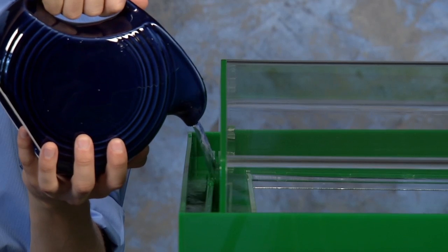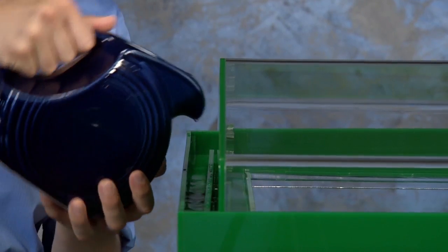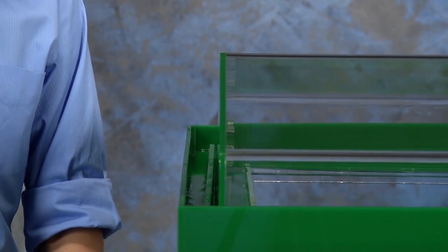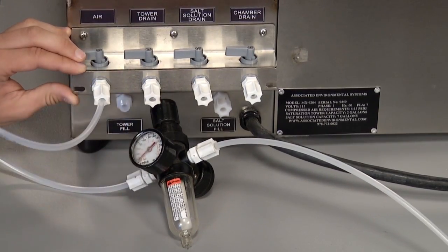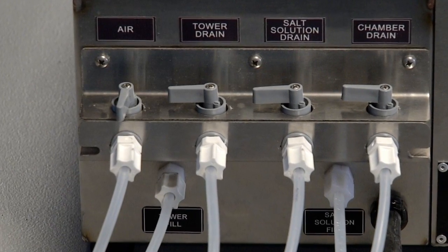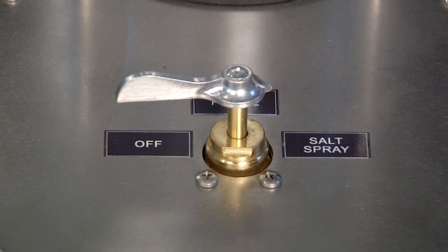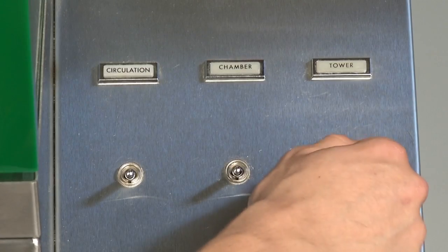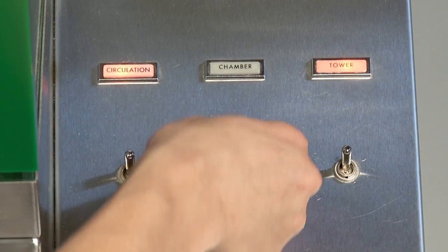Fill the top cover trough and close the cover. The top cover of the chamber has a water seal to prevent salt fog from entering the room. Fill this trough periodically with distilled or demineralized water. It is important that the chamber be properly leveled in order to provide a satisfactory seal. Connect the chamber compressed air supply, ensuring that the air is supplied at the correct pressure. Open the chamber air valve. Turn the compressed air supply on with the selector valve in the salt spray position.